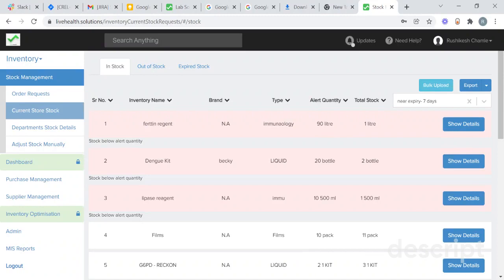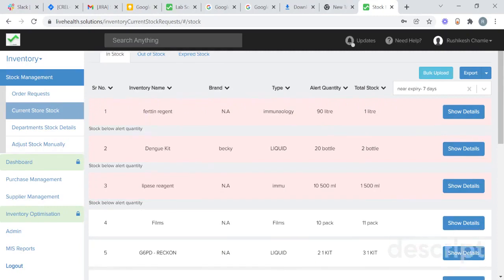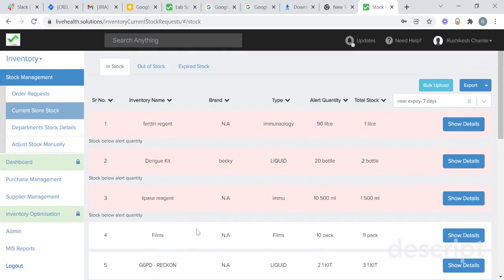Hello, let us see how you can manage your lab inventory by using our Krelia Health inventory management software. By using our software you can manage your inventory at store level as well as at department level. In current store stock, at the stock management section, you will get details of the stocks which are currently present at store level.